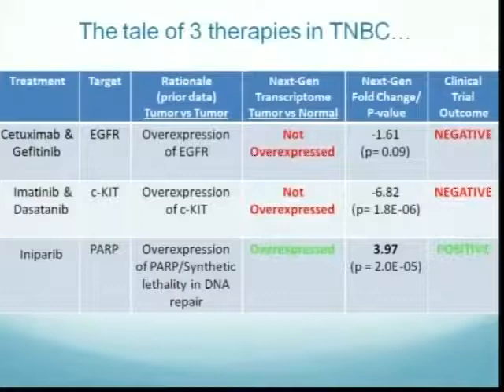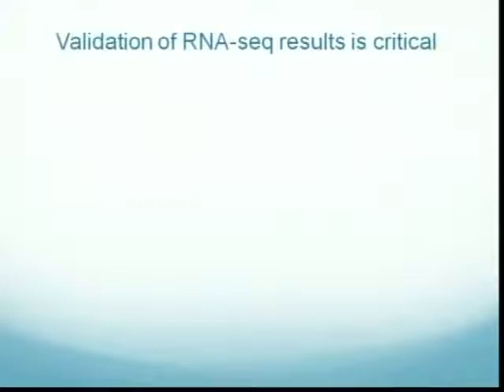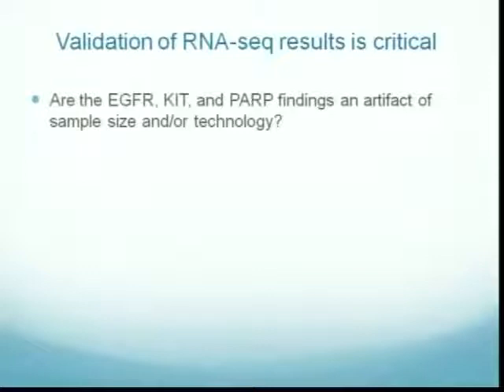So as with any RNA-seq study, though, the validation of your results is absolutely critical. The reason why is a lot of people can maybe try to downplay your results, saying, well, that's just an artifact of your sample size, or you're working with some newfangled technology. How do you know that's actually real?